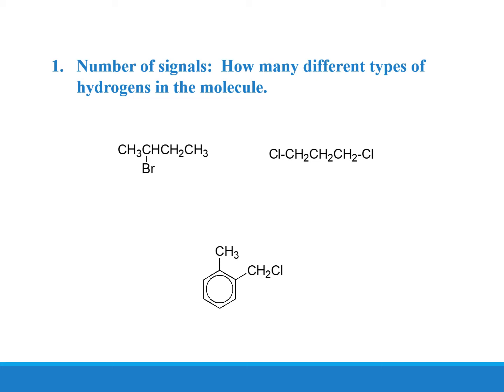In fact, you do not see any chlorine in the methyl group, so certainly these protons will have different chemical shifts.